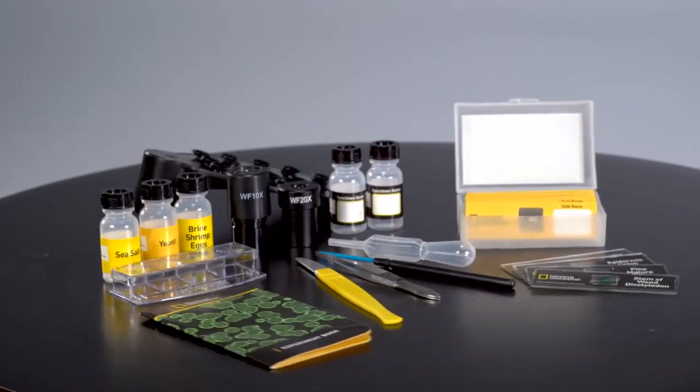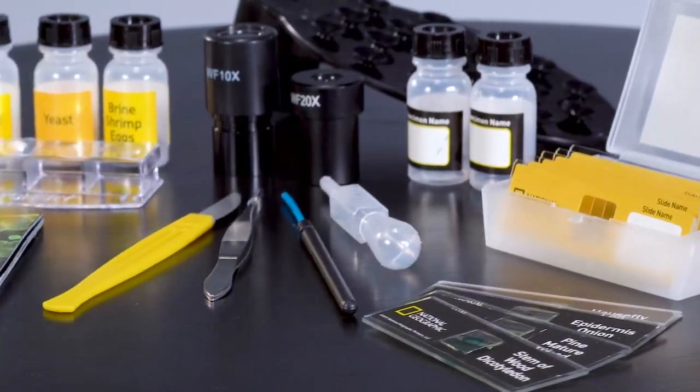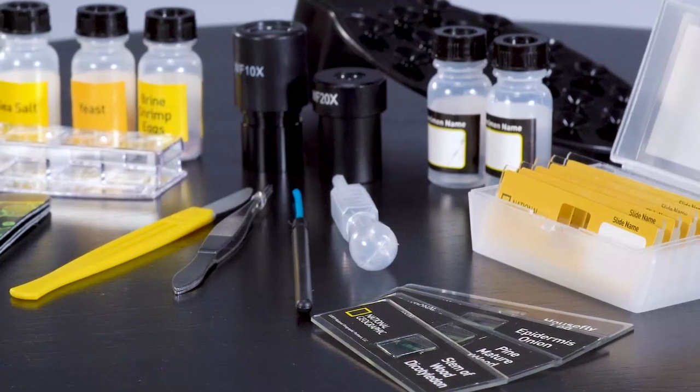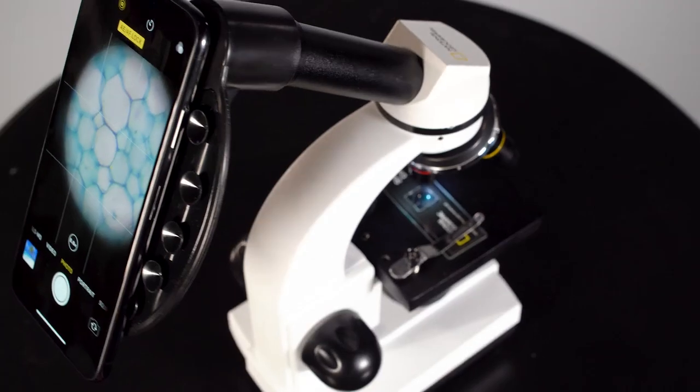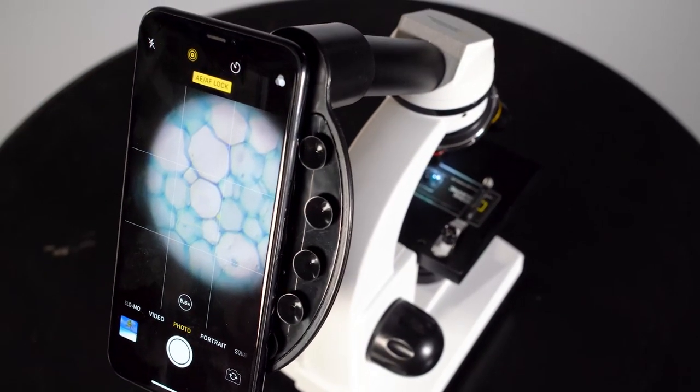You can start investigating right away with the full accessory kit that includes collection and preparation tools, prepared and blank slides, a shrimp hatchery, and an easy-to-use cell phone adapter for on-the-go exploration.